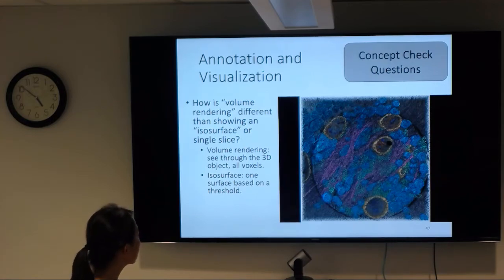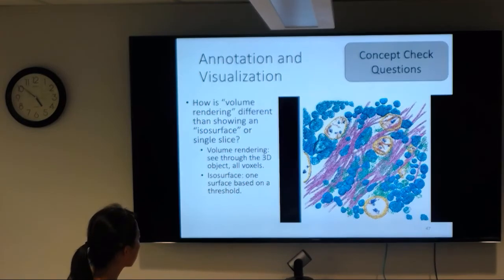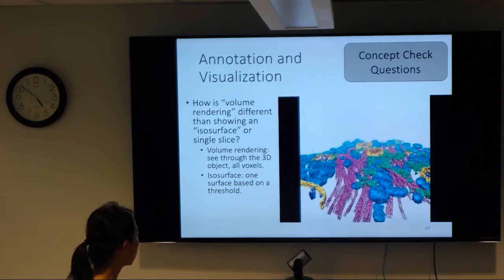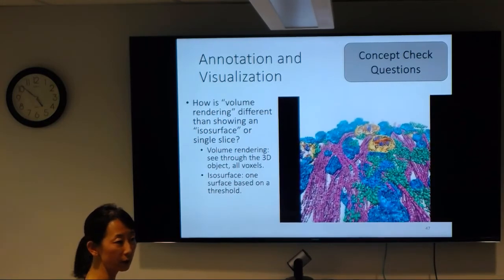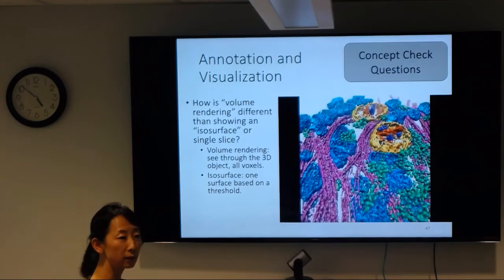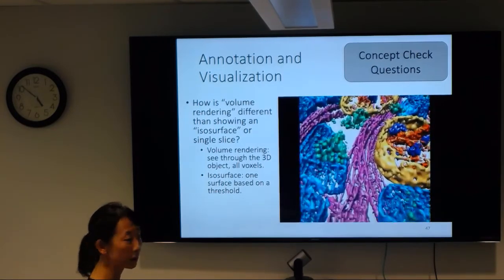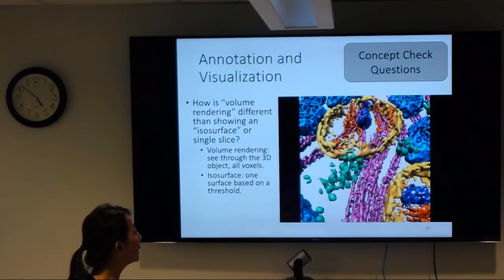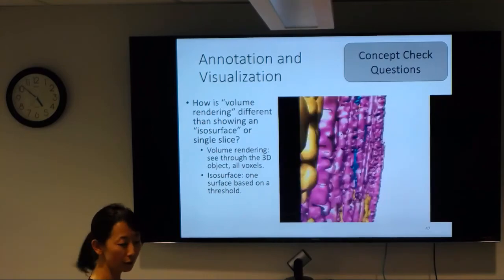Once the volume rendering is gone, you will be able to see how everything interacts with everything, to really look at your tomograms in 3D view. You can zoom in, you can dive in. This is the advantage over slice views. It's a real 3D annotation of your data.